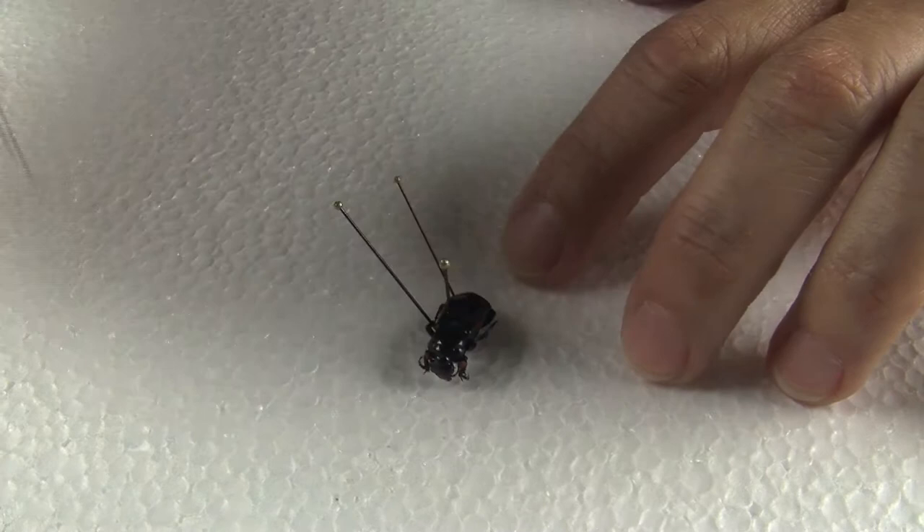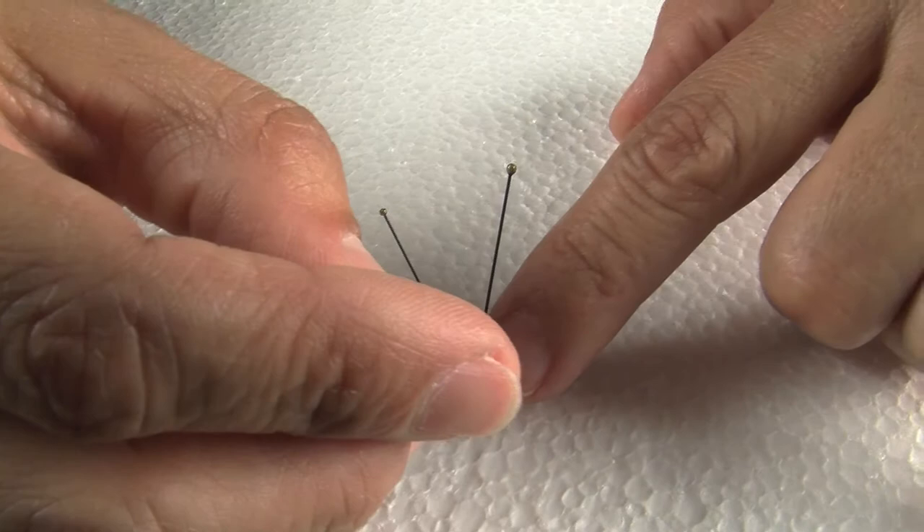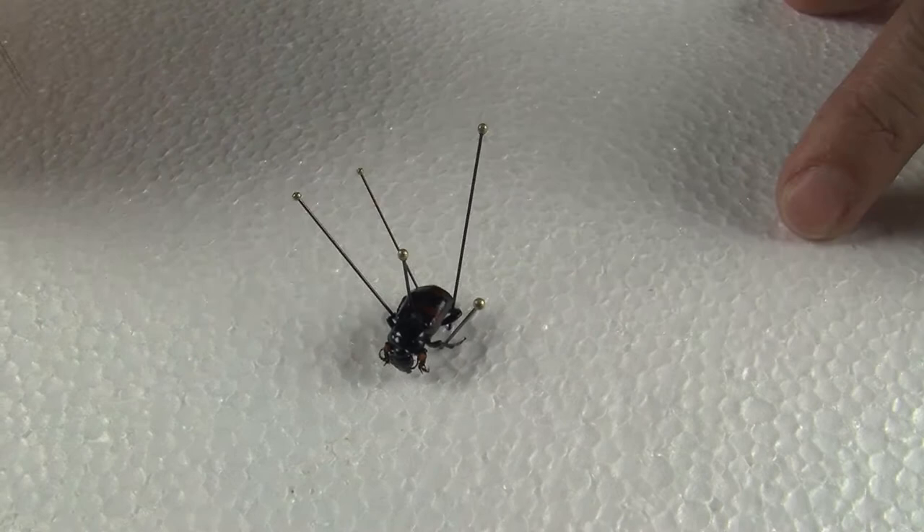And if you break the insect, don't worry, because you can use either nail polish or insect repair adhesive to put that piece back. With a little bit of patience, your insect will look perfect.